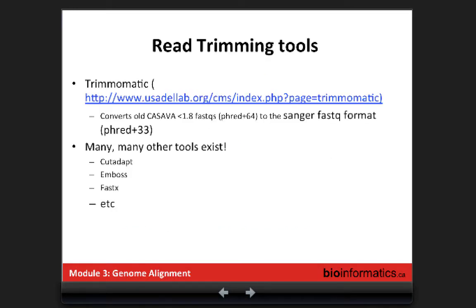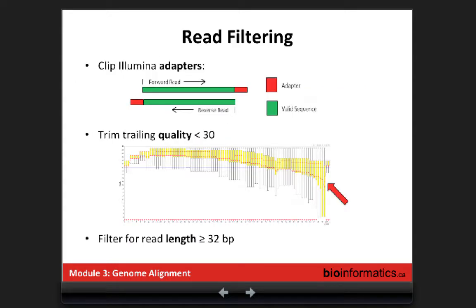Last question. Is the reason the quality is lower toward the beginning? Is this an RNA sample? No, it's just because in the first cycles the machine needs to calibrate, and especially with the older flow cells, we need to define the clusters. Now with the new patterned flow cells, each cluster is already pre-positioned on the flow cell. The machine knows where each cluster is at the beginning. The quality starts really high and it's almost flat.